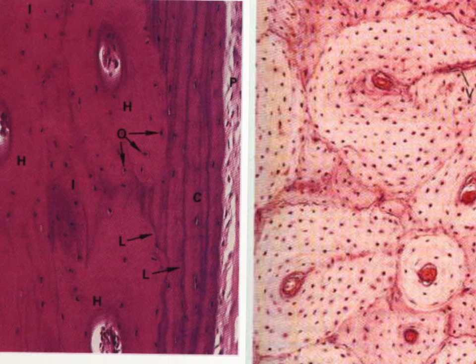In the second picture also, as it is stained, it is a decalcified compact bone. What can we see here? You can see in this photo the Haversian blood vessel.